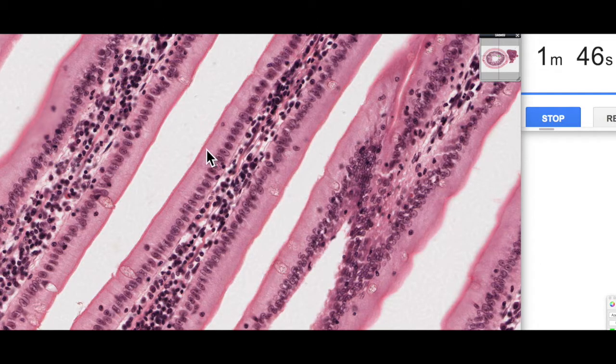Whereas the cytoplasm you can see is very pink, very acidophilic or eosinophilic, so there's lots of protein there. What protein is staining inside the cytoplasm? It's largely going to be the cytoskeletal protein: the microtubules, the intermediate filaments, and the microfilaments.